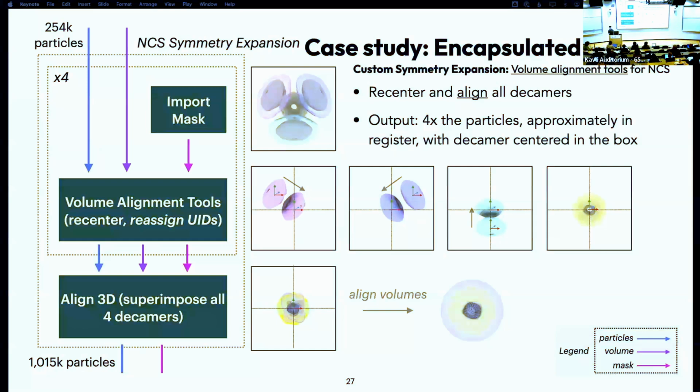Right. And my question here is, it doesn't look like the ferritin is very close to the inside wall of the Encapsulin. So is there really a lot of contact at all between the ferritin and the shell, the Encapsulin? There has to be something, because otherwise it wouldn't be inside at all and wouldn't look like a tetrahedron. But it's much different than that kind of symmetry mismatch, which we've seen a lot of in viruses.